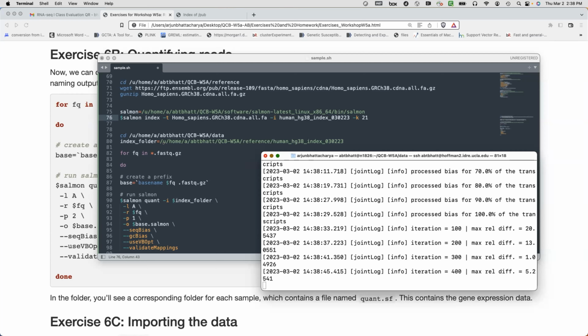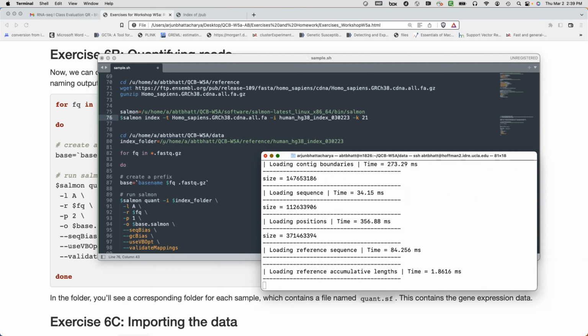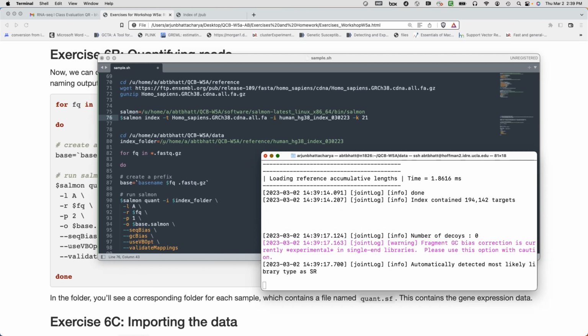But I'm at the point where now I'm working with long reads and trying to identify novel exons or alternative exons or novel transcripts, and that's where an aligner is extremely important, even for quantification, because we want to be able to move beyond the annotations. There's also literature we can talk about once we've quantified.